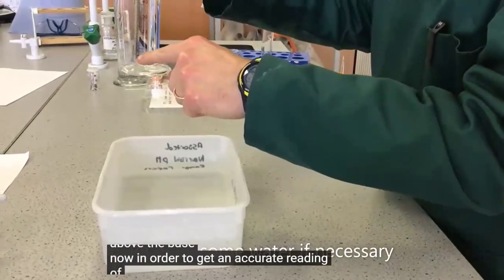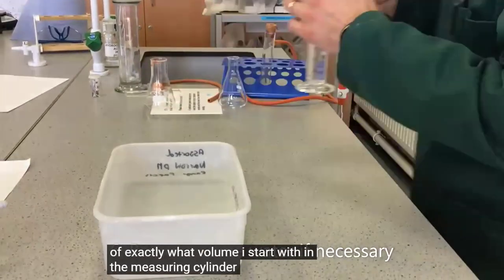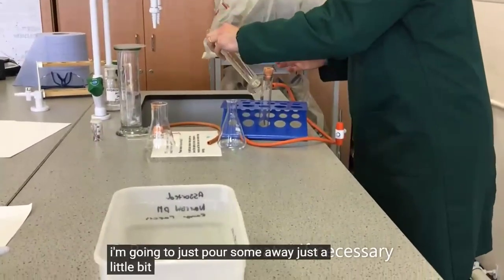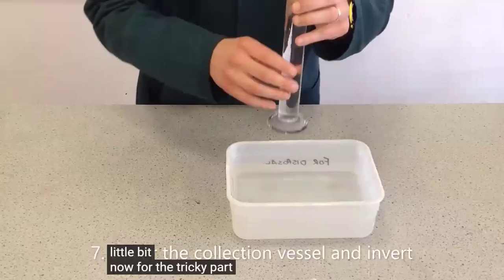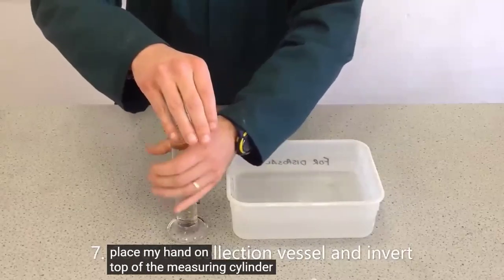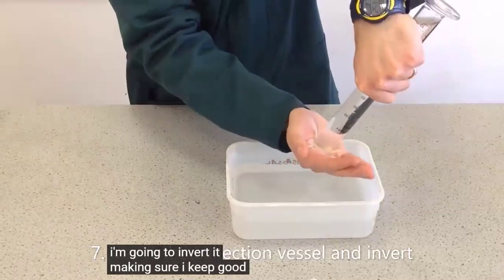Then you have to invert it over the container containing water, and invert it in that way so that water won't go out. Now just see, it's going to invert. You can cover it, and then invert it in the container inside the water so that water won't come out.